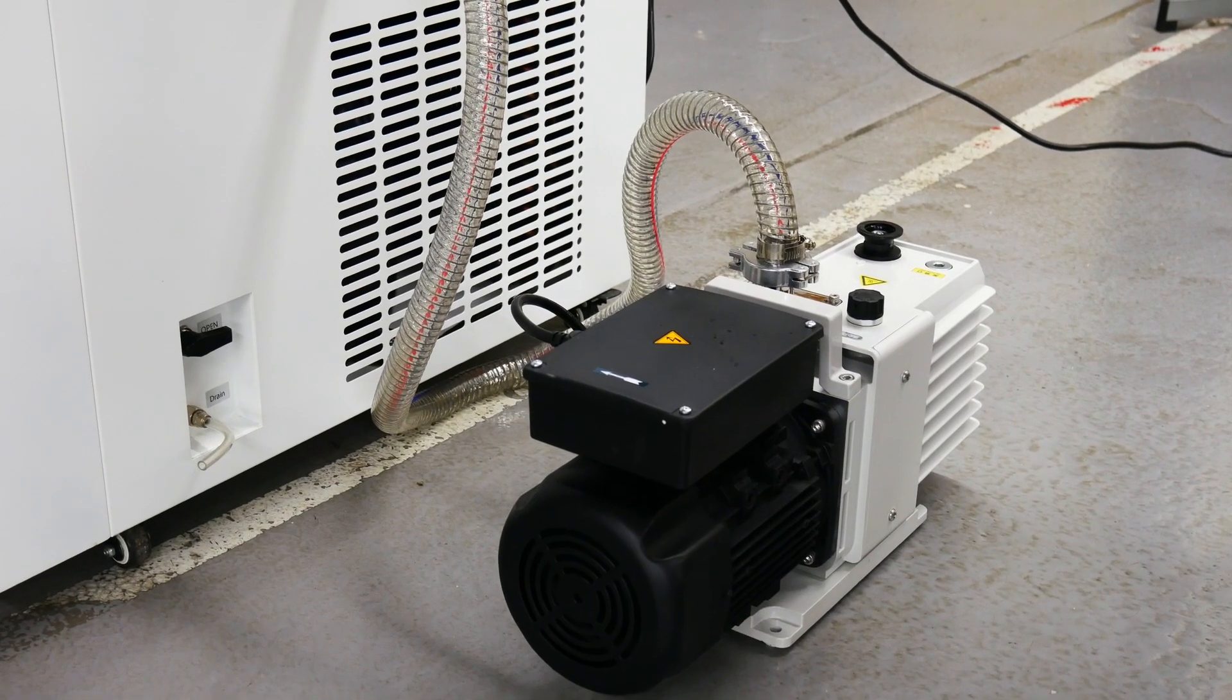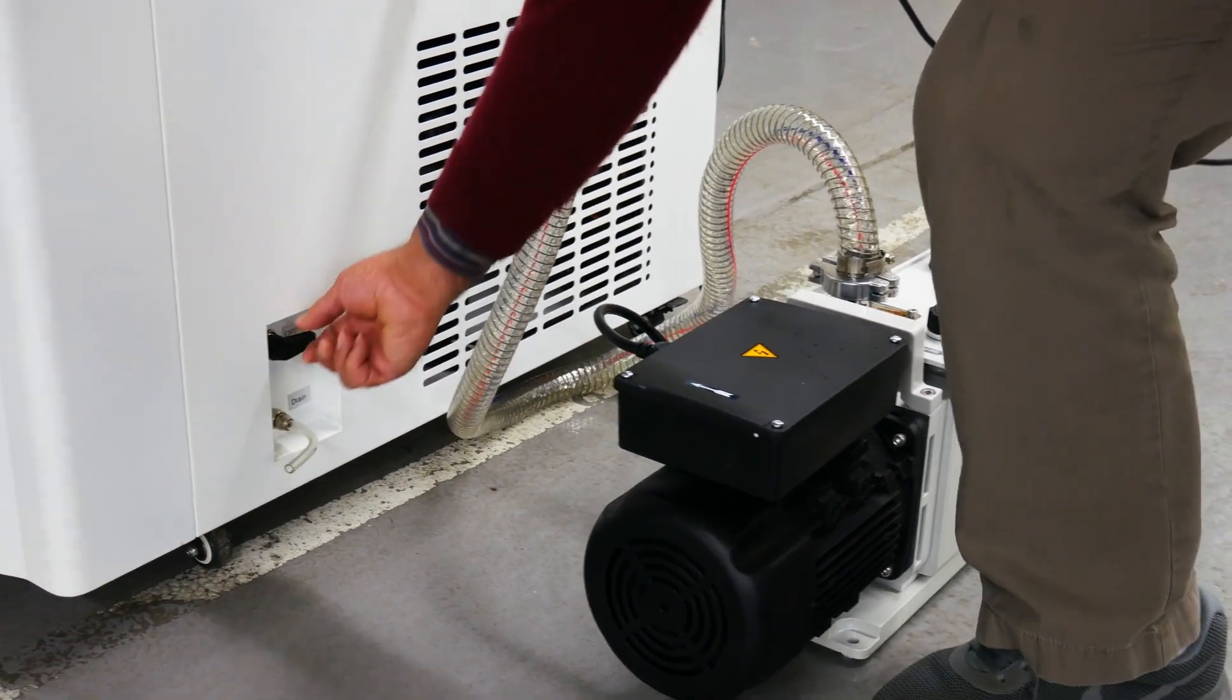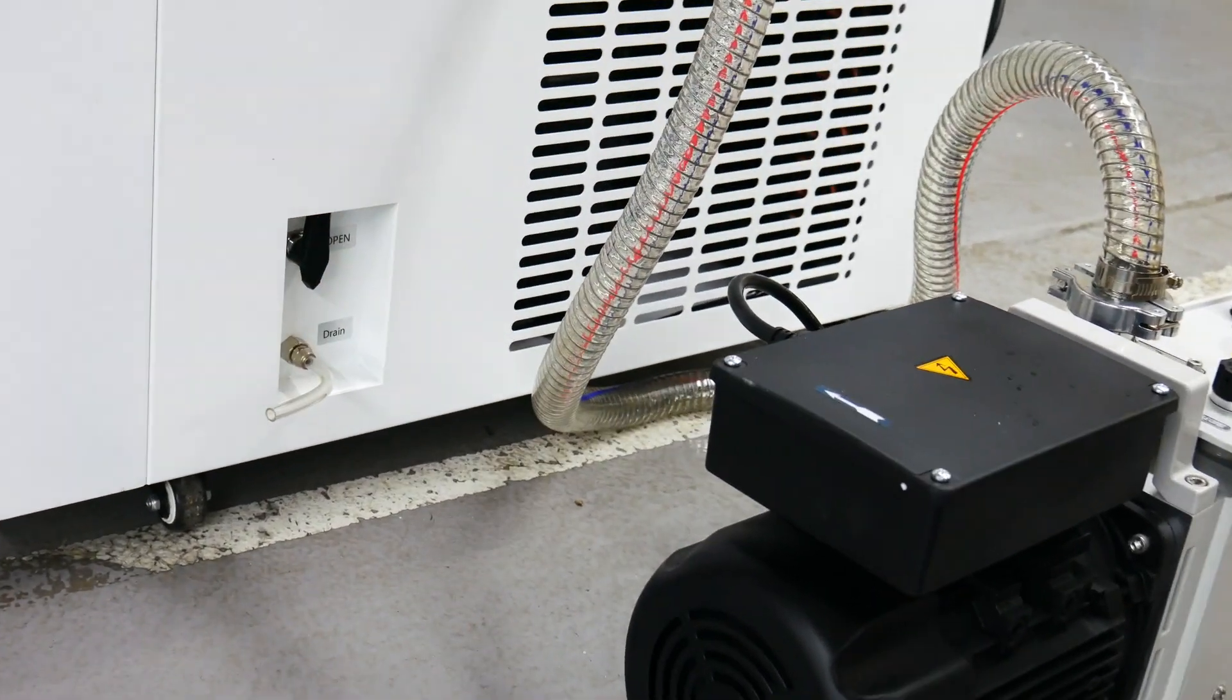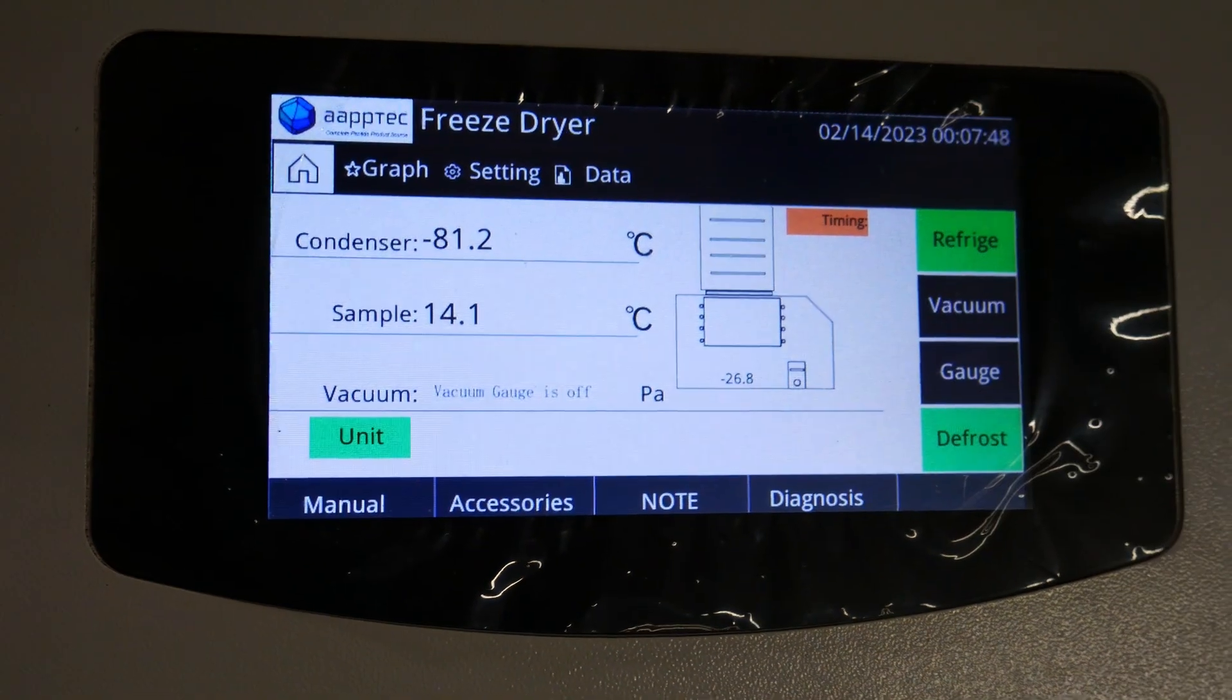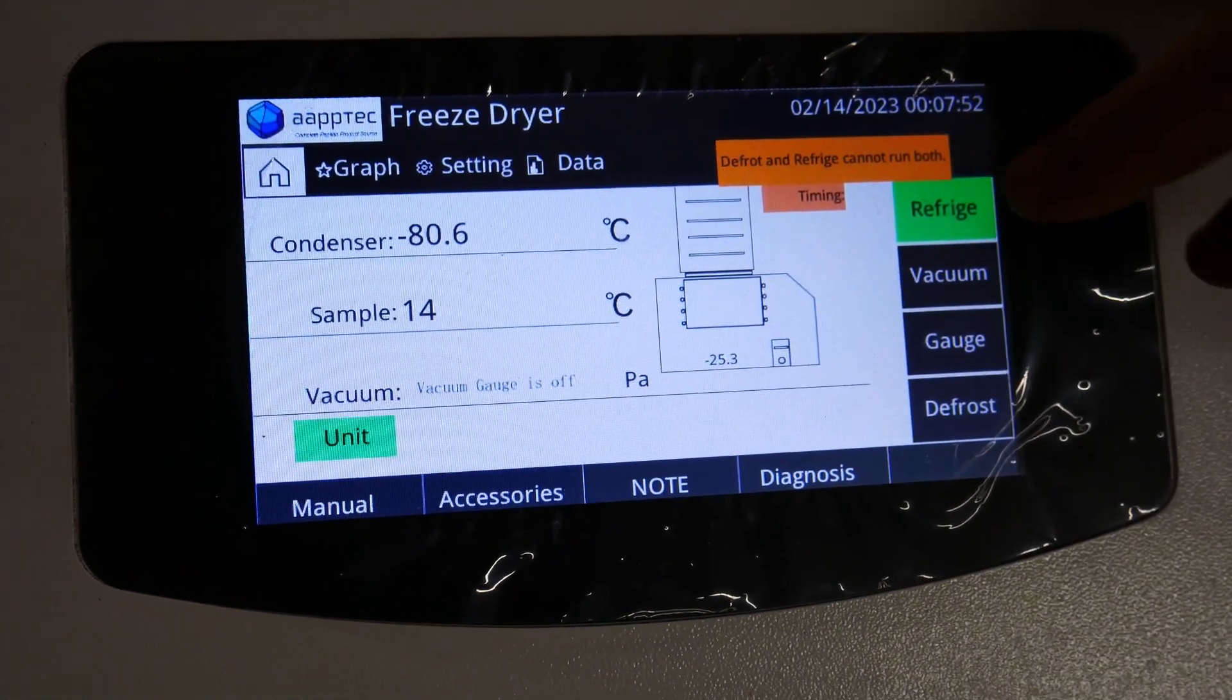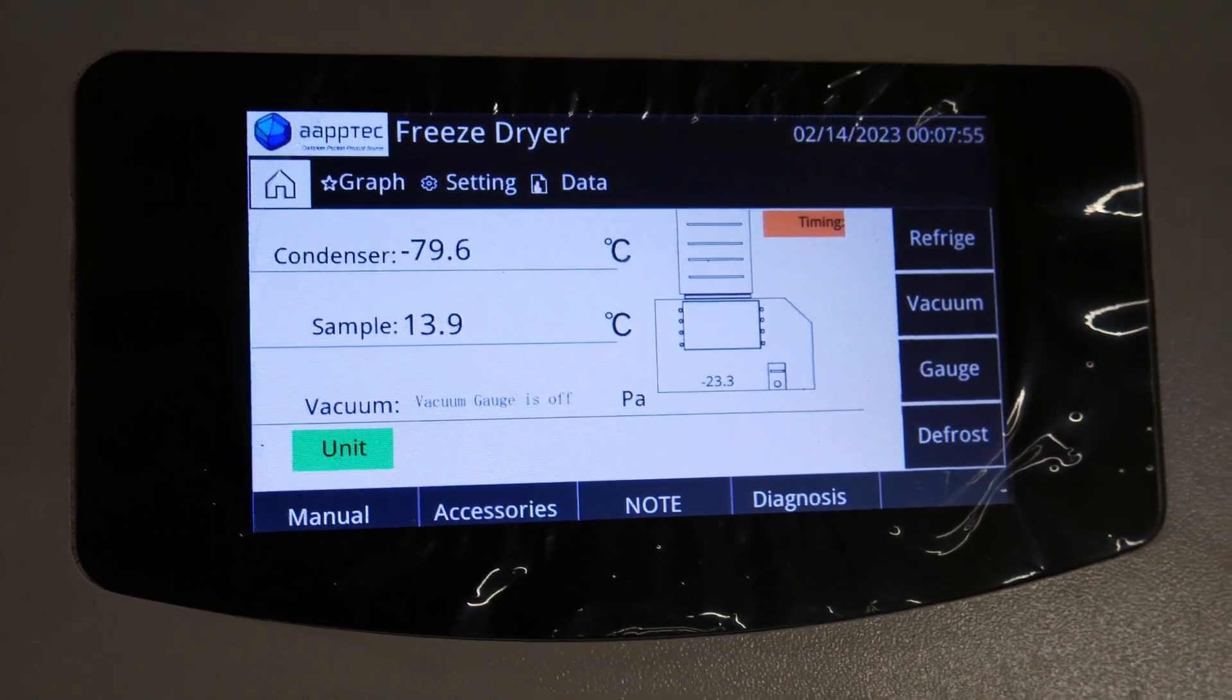To shut down the system, first, you turn off the vacuum in the system by opening the air. The pump starts increasing because of the air going in. Now, you press here to shut down the vacuum. You turn off the vacuum, the gauges, and the defrost. If you want the defrost on, simply leave it on. Then, you turn refrigeration off, and this automatically turns off the whole system.